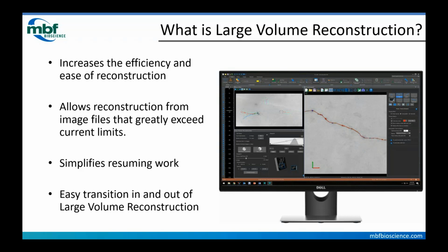So, for example, if you were detecting dendritic spines in a pyramidal cell and you've got apical dendritic spines that are really densely packed together, you may have good success using a particular set of parameters that just don't operate with the same amount of accuracy on the basolateral structures where the packing density of the spines looks different.